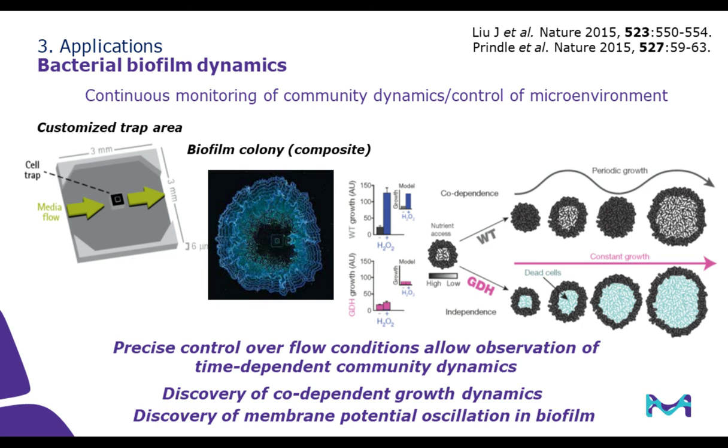The size changes of the biofilm, or the so-called periodic growth, was identified by several scientists. One of them was Professor Süel at UCSD. He was able to use our previous prototype to trap and grow biofilms and introduce environmental perturbation, and observed that biofilms could grow and reorganize and grow again and reorganize again. If you mutate this gene to remove the protein, the size wouldn't change. He published a paper in Nature and linked this protein with biofilm periodic growth.